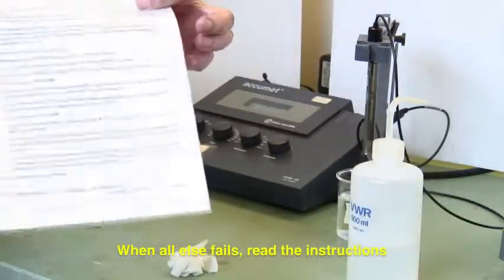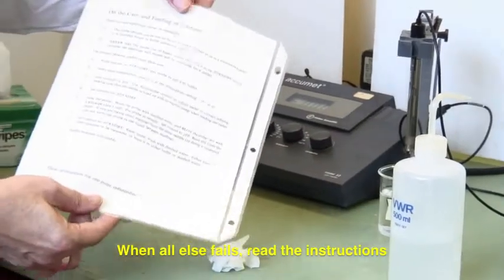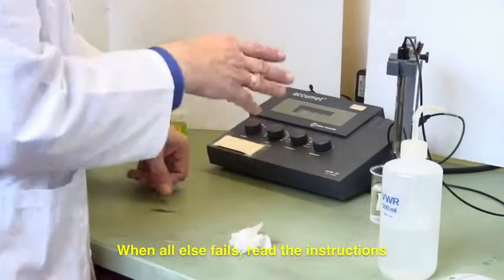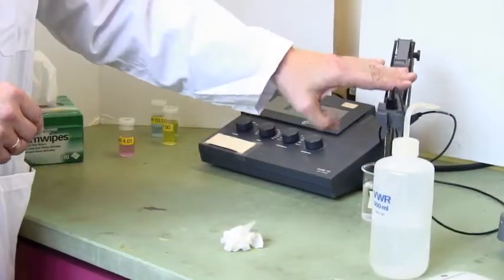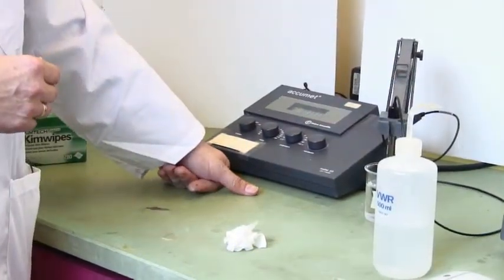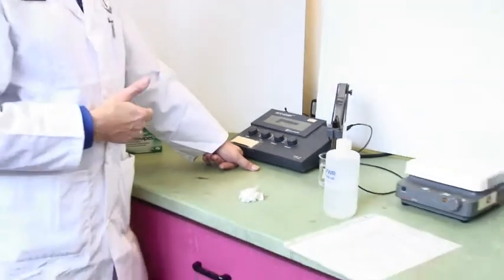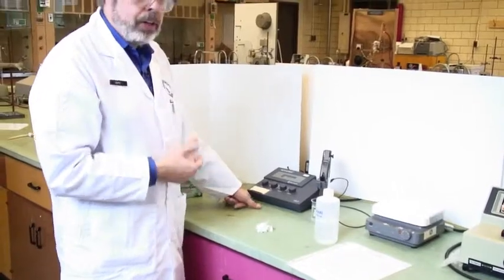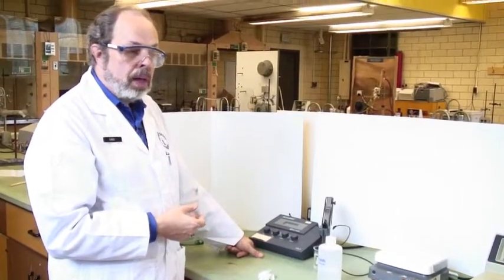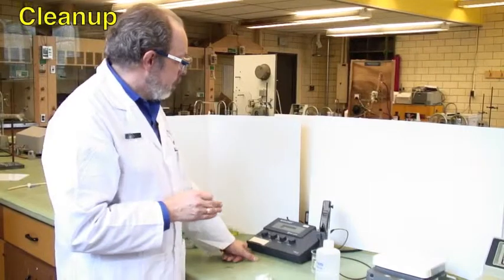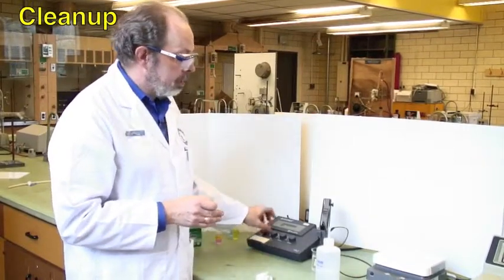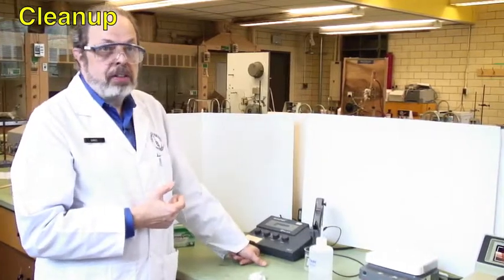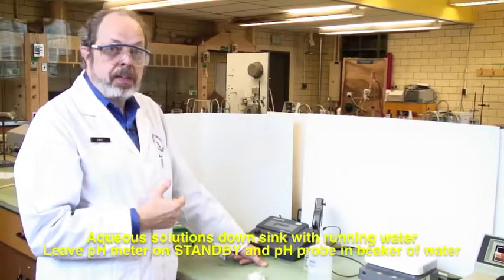If you forget, there is the instruction of how to standardize a pH meter is always going to be nearby to the pH meter, so you won't travel very far. When you want to read, just put your solution under the electrode, turn it onto pH, and it'll tell you what the pH is. At the end of the day, please leave this on standby. Make sure that it is washed off and in a beaker of fresh distilled water for the next person to come along.